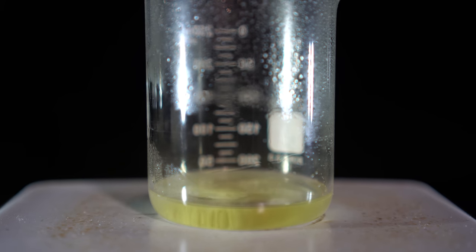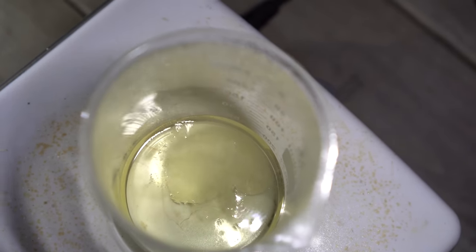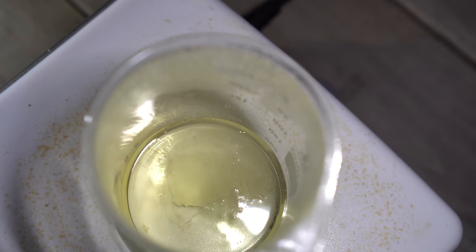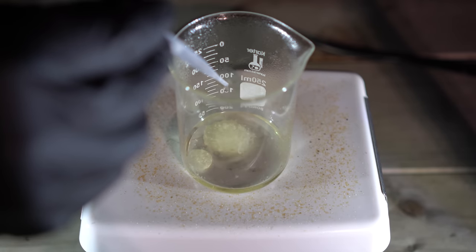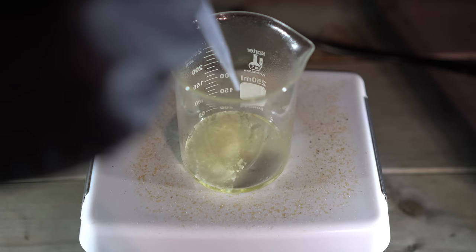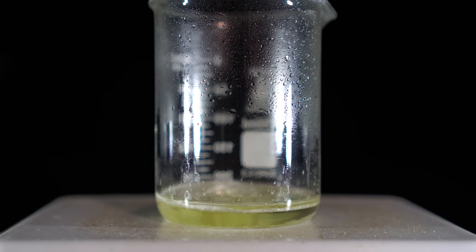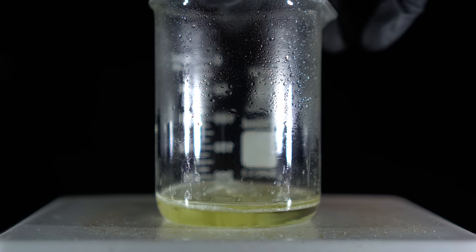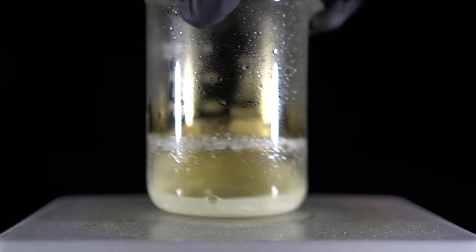What we're left with is a slightly yellow solution with a little bit of silver still in the beaker. The rate of the reaction has slowed down enough that my patience is on thin ice. To break the ice, I'll just add more nitric acid. Upon the addition of the nitric acid, you can see that a lot of silver nitrate actually precipitates out — it's not as soluble in concentrated nitric acid. When I swirl the beaker around you can see quite a bit comes out of solution.